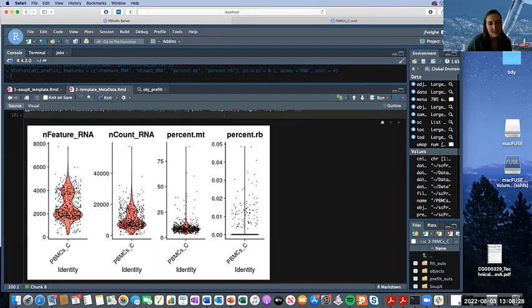Depending on your cell type, you might want to filter out and set a cutoff point for the number of different genes being expressed in a cell. The reason is that there could be multiplets or doublets as part of the droplet-based library preparation process. You have your cell in your bubble with the gel bead, and usually it's one cell, but if you have stickier cells like macrophages, like me, you might get a few cells in there.